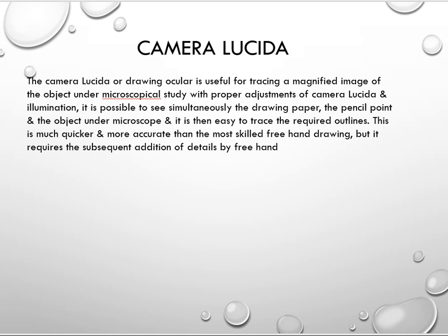Alright. Now we have another instrument used in microscopical evaluation, that is the camera lucida.